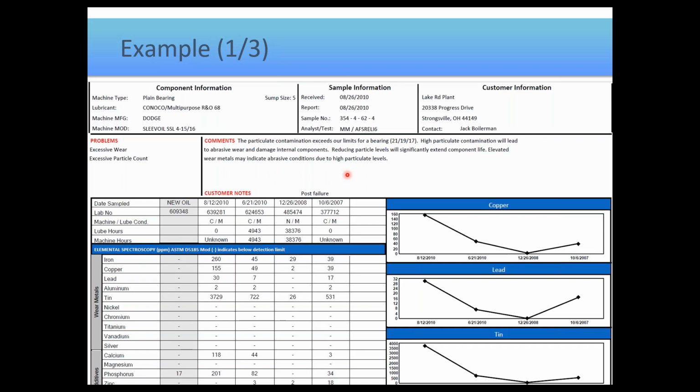So they don't necessarily know if their answer is spot on, able to be applied. So if they tell you that maybe you should think about changing your filters, you may come back to them and say there are no filters on the system. The point is they're only able to make a reasonable guess with what they have. And this is why I'm going to stress later why the end user should be the one to read the report. They may know things that would give better insight as to what to do next. But anyways, there's the problems, there's the comments.